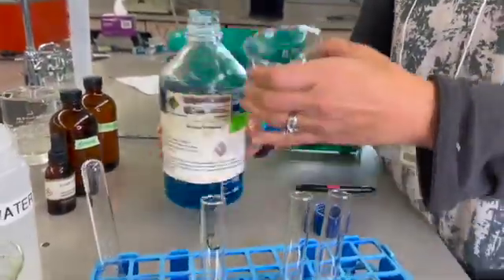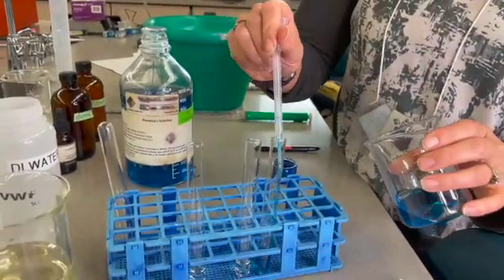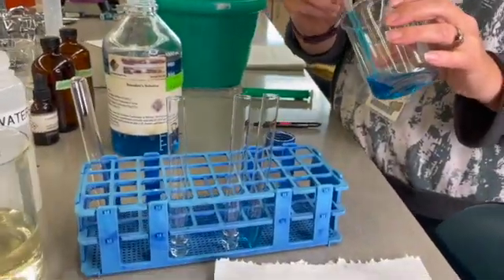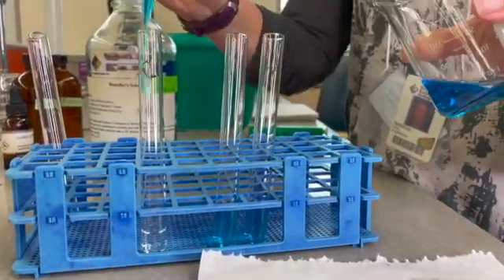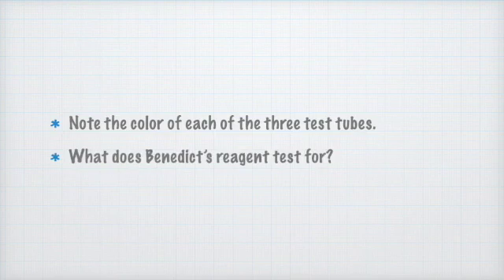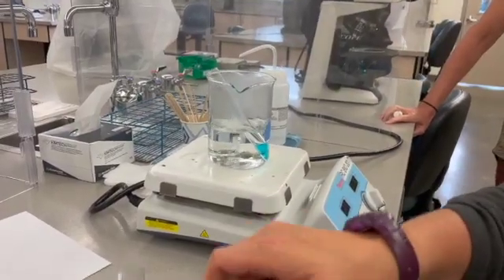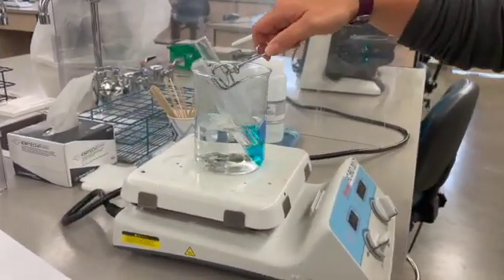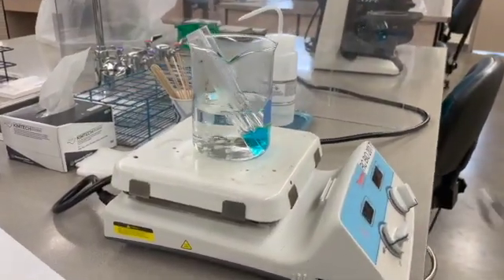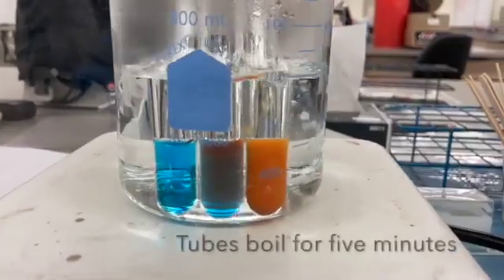We now add 2 milliliters of Benedict's reagent to each of the 3 test tubes. To carry out Benedict's test, we submerge our test tubes in boiling water for 5 minutes. And watch our tubes closely. As you can see, changes are happening rather quickly.